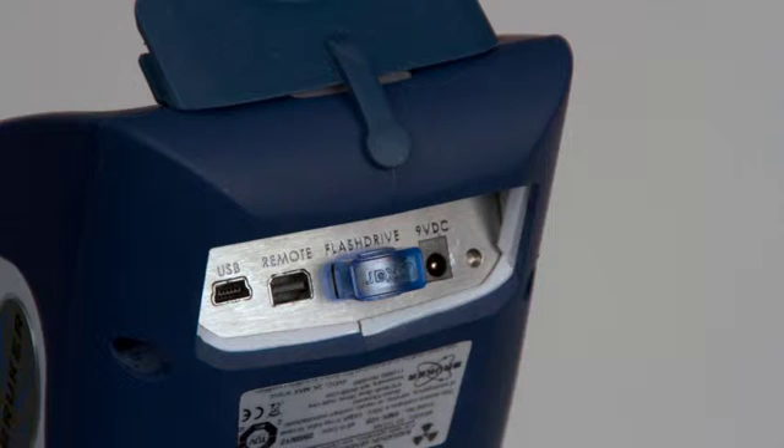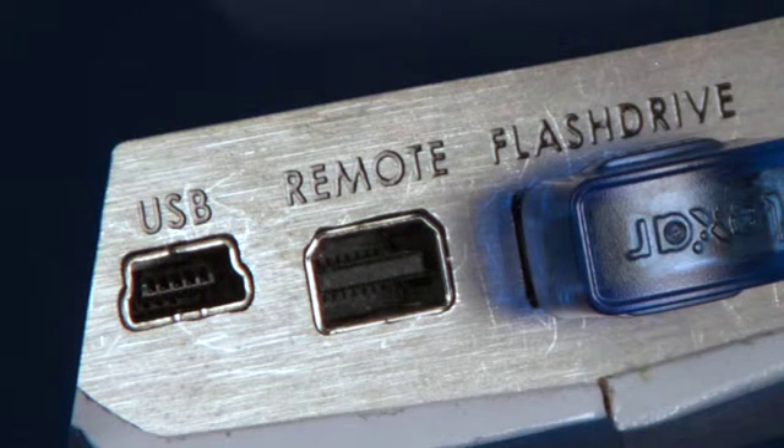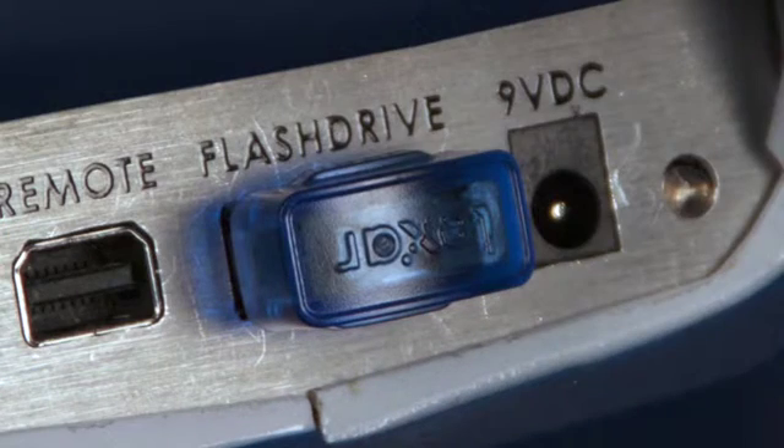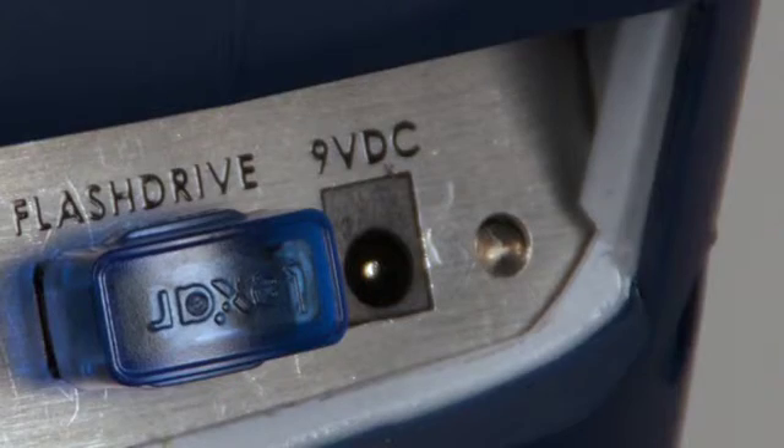The rear panel port area is located underneath the control panel. The USB port is used for USB connections to a computer. The connector is a USB Mini-B, so the appropriate cable for connecting to the computer is a USB-A to USB Mini-B cable. The remote port is a general purpose I/O port, which is used for connection to optional accessories. The flash drive port is used for connecting a USB flash drive for the purpose of storing and transferring data. The 9-volt DC port is for the optional AC adapter.